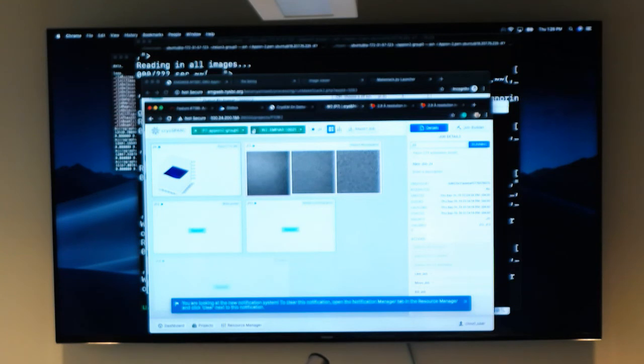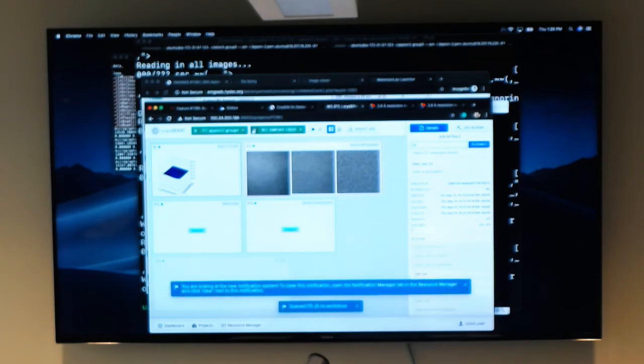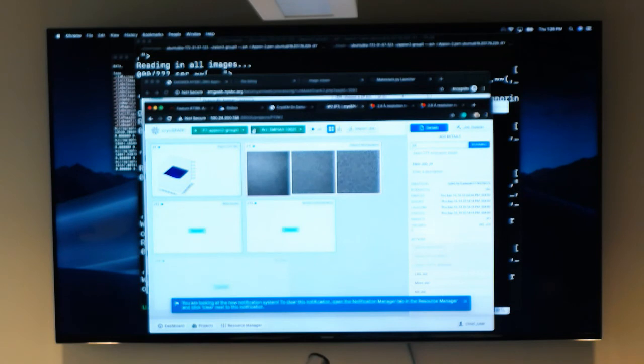Yes, I see. C1 it is for this instance. We'll have to get better GPUs for you if you want to. No, probably for refinement, I'll just give you three. It should work for refinements. Right, well, that's what I'm using.